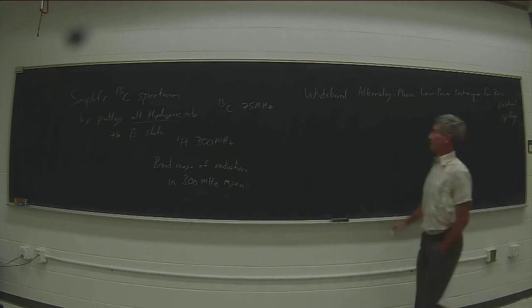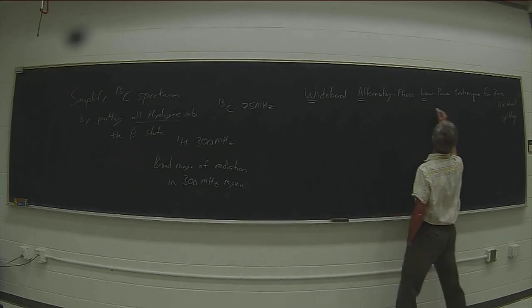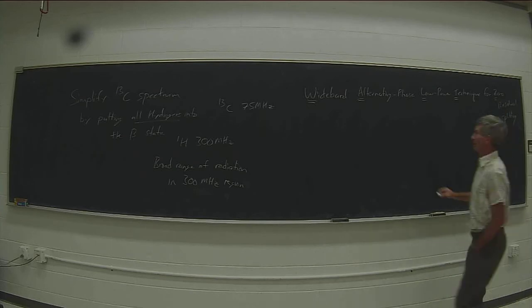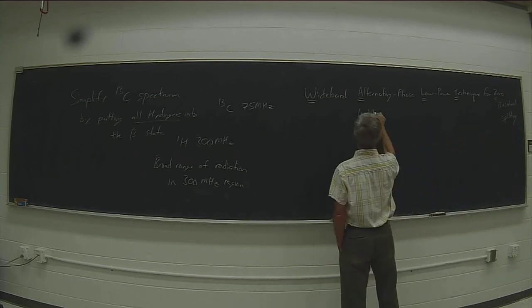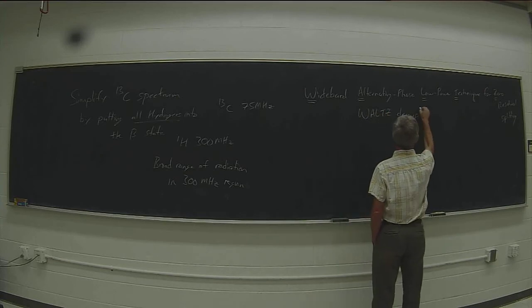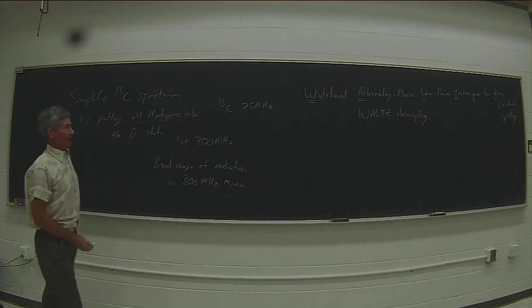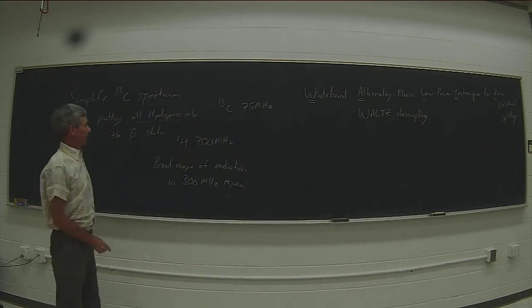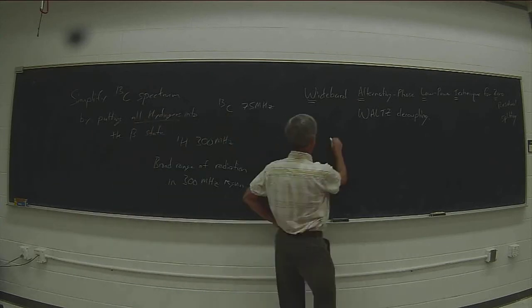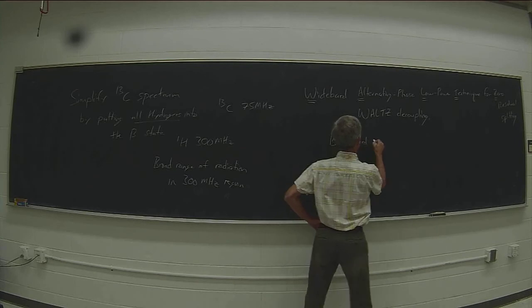And it has the kind of cute acronym WALTZ, because we like cute acronyms. It is referred to as WALTZ decoupling. It prevents the splitting of a carbon signal by the attached protons. Sometimes it's just referred to as broadband decoupling.